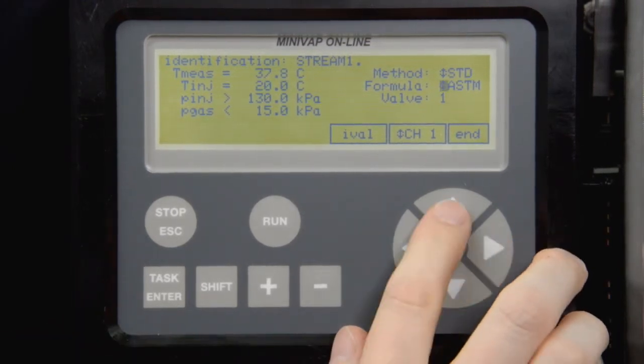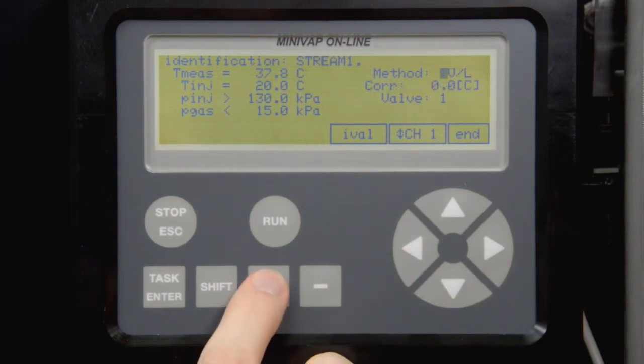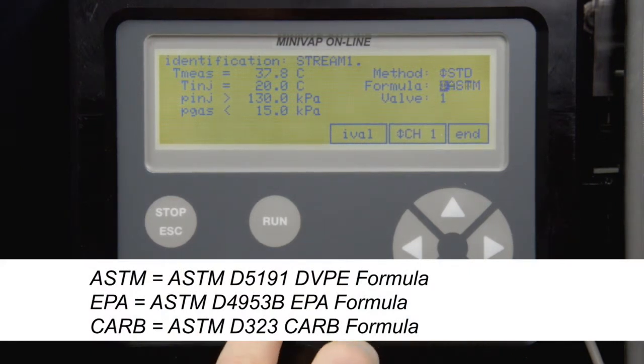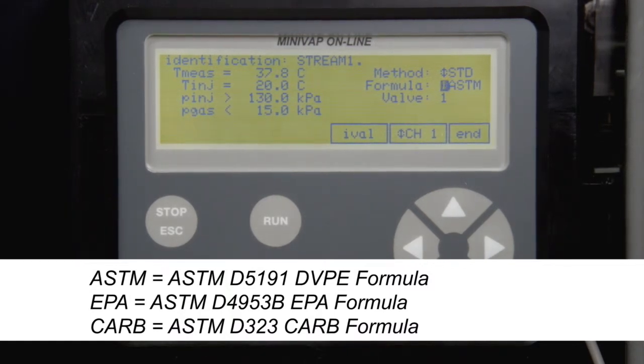Select a method for gasoline, crude oil or LPG. Then choose the standard and apply the correct formula. For standard gasoline measurements, ASTM is the approved DVPE formula for D5191 measurements. EPA is the EPA-approved correlation to ASTM D4953B. CARB is the D323 gasoline correlation formula used by the California Air Resource Board.